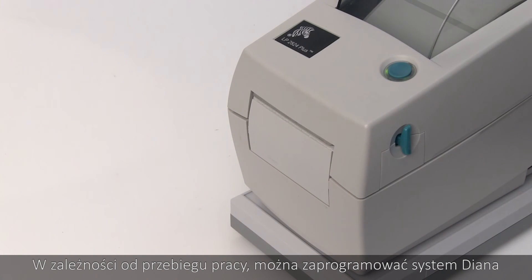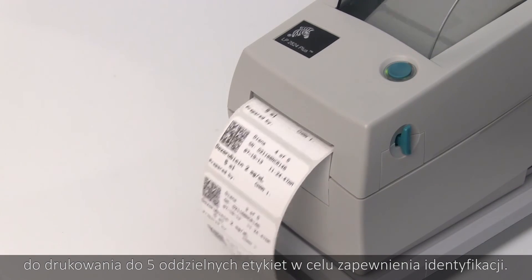Depending on your workflow, you can program Diana to print up to five separate labels for traceability.